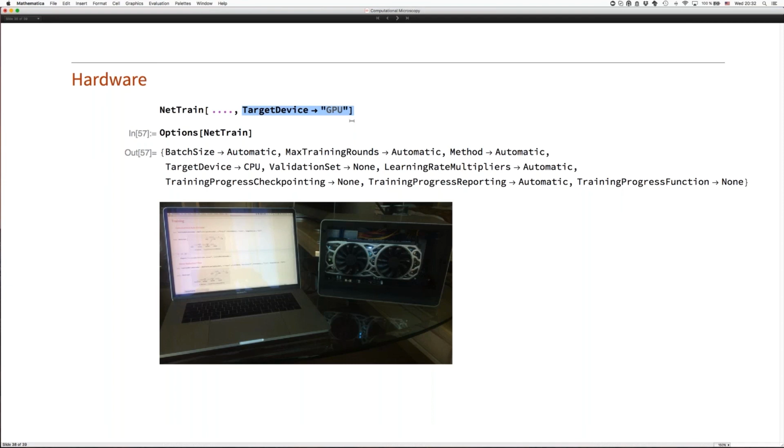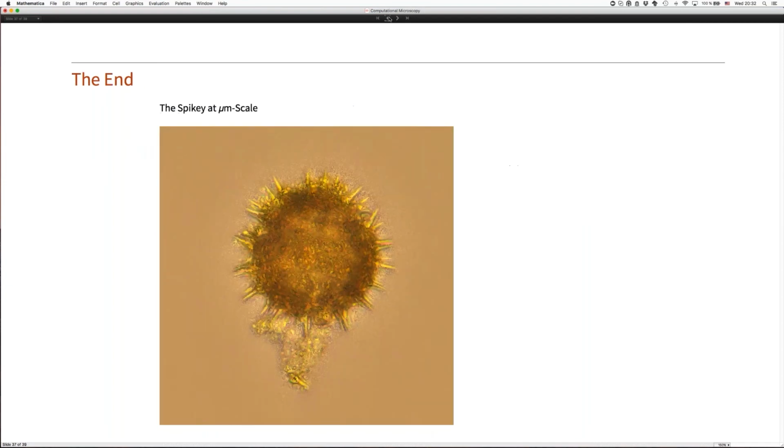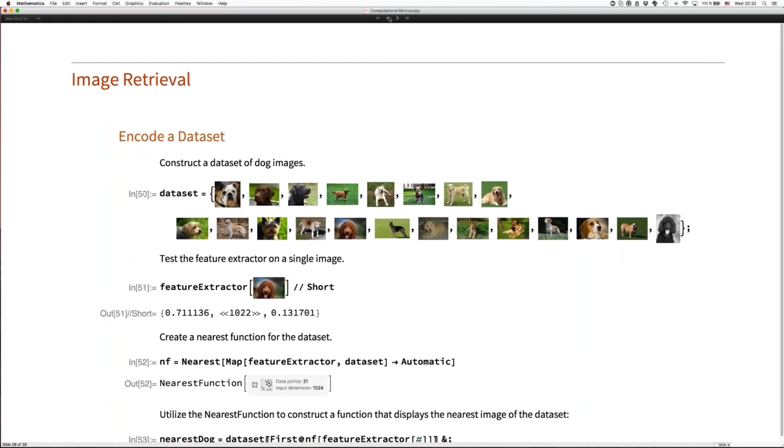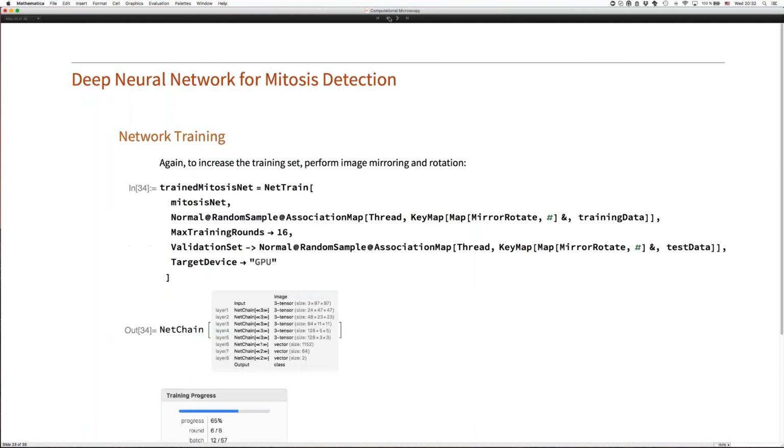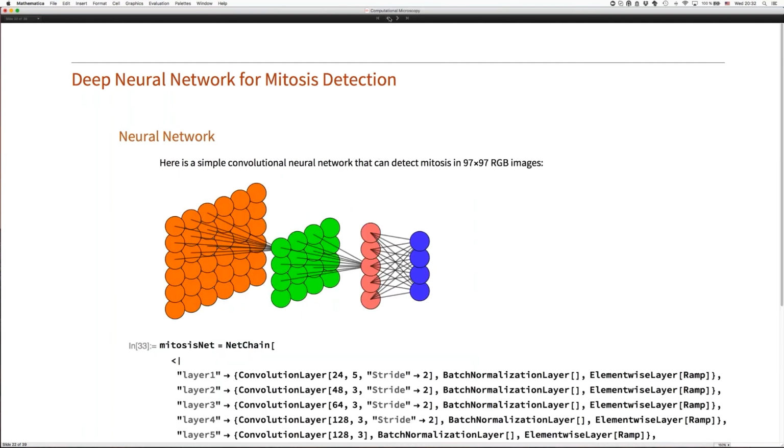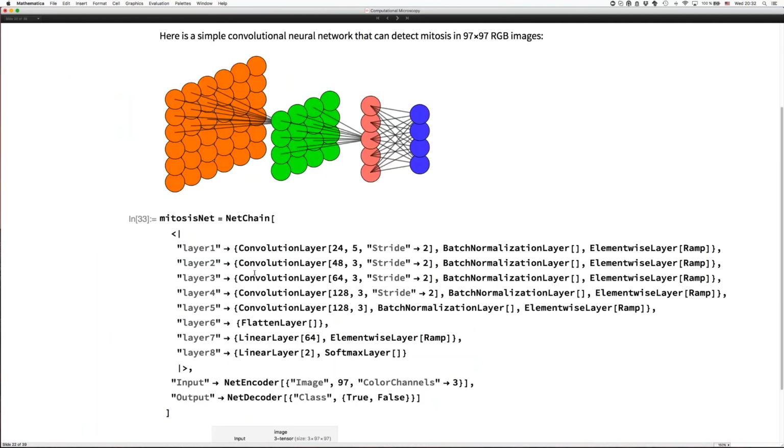The next question that popped up, and that's a classic, is when I was promoting this one neural network for mitosis, how do I know how many convolutional layers to take, when to do a fully connected layer, how many channels, how many features to run in parallel, and so forth.